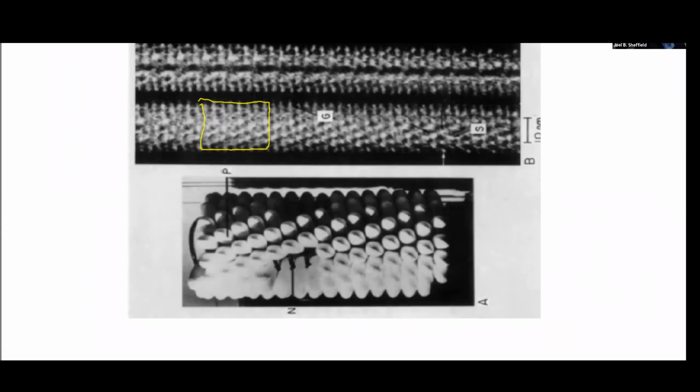So even at this time, people were manipulating these images. There was a man by the name of Markham, called now the Markham technique, which was a photographic reinforcement.